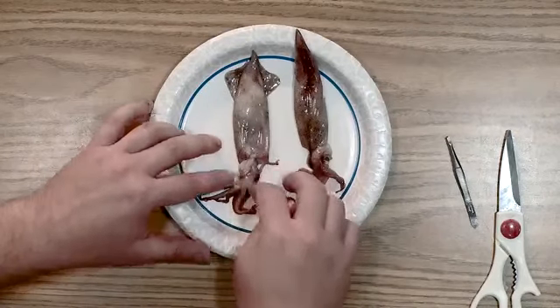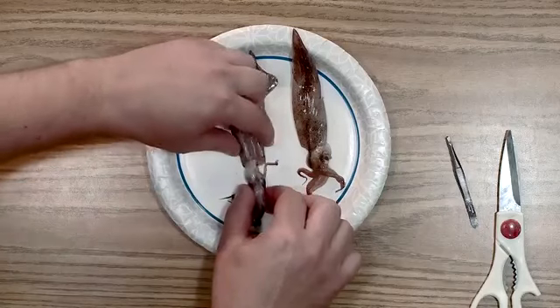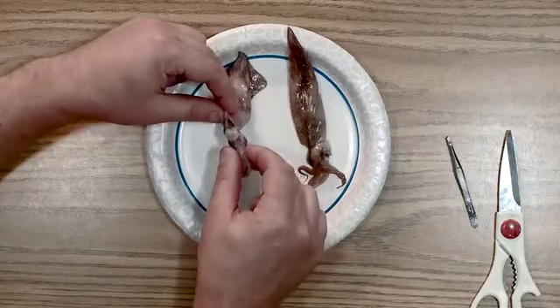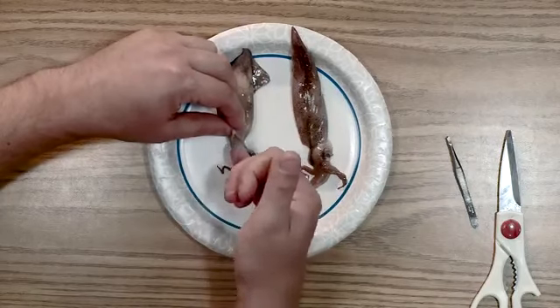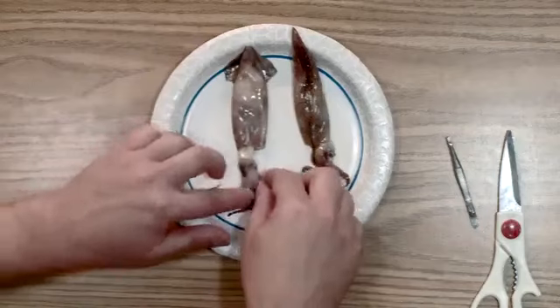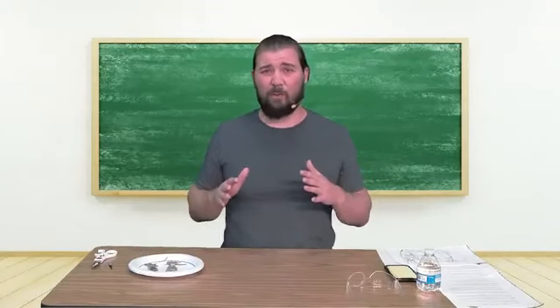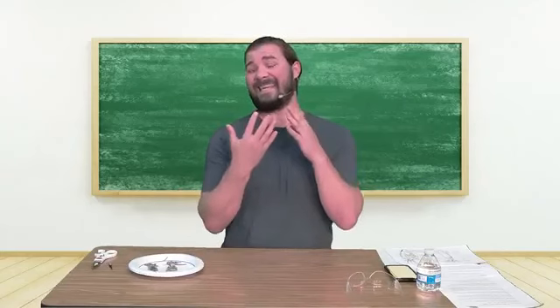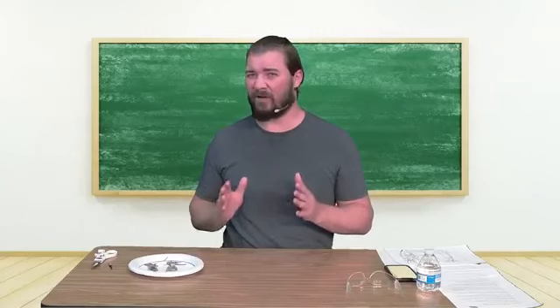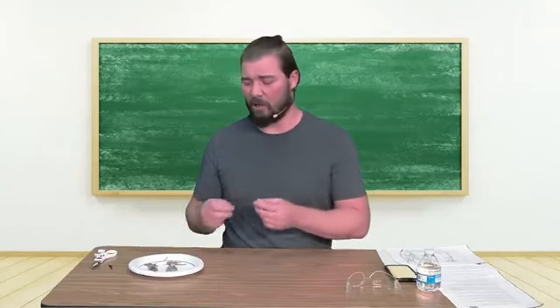As we continue down, you'll see that it's not specifically connected or sealed here. There's actually openings here to where I could put my finger up inside the squid right away. Now, that means when this squid is swimming around in the water, water can get up inside of that mantle and flush stuff all around. It's very different than a closed organism. It's got those open passageways.